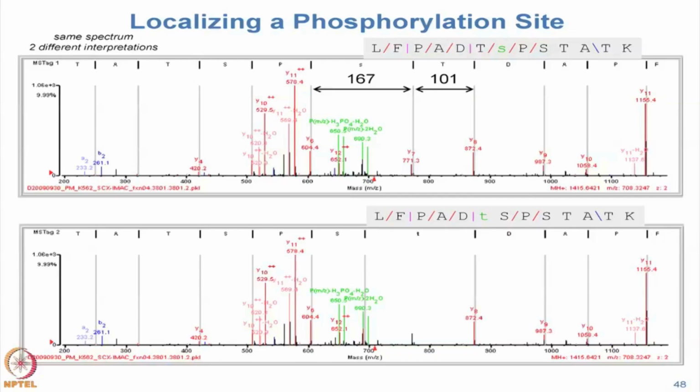All right. So if you were instead to allow 87 for the threonine, or for the serine, that would stick this in a sort of messy part of the spectrum, and then the gap out here would be shown as this ion to this ion, and that would leave that unexplained. But because those two residues are right next to each other, you're not going to get much information to work with in order to make your decision.